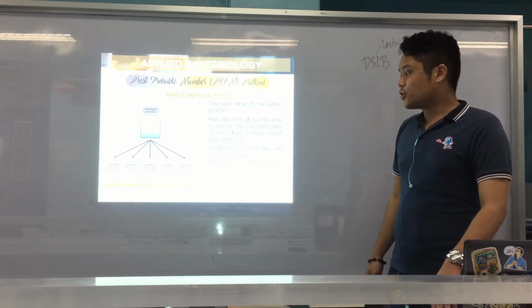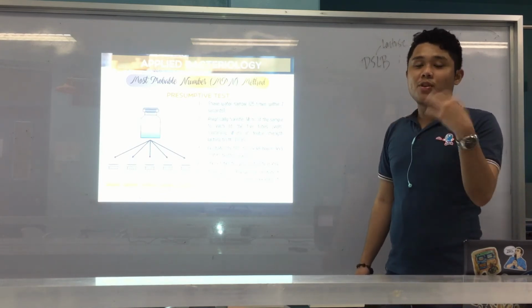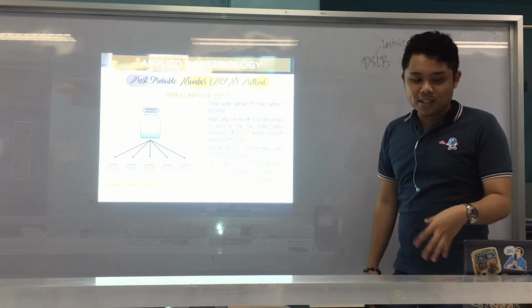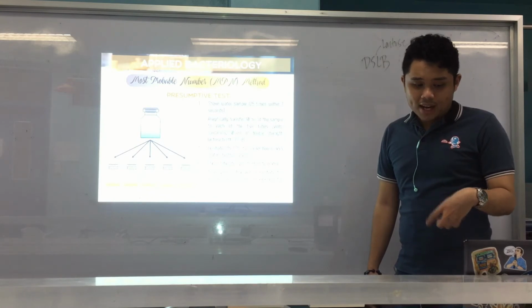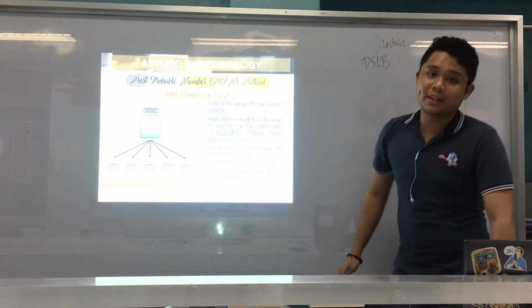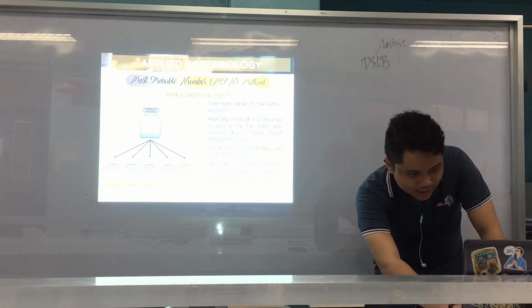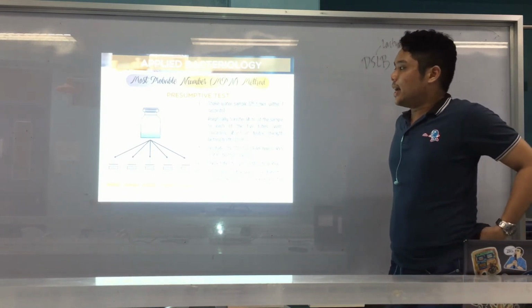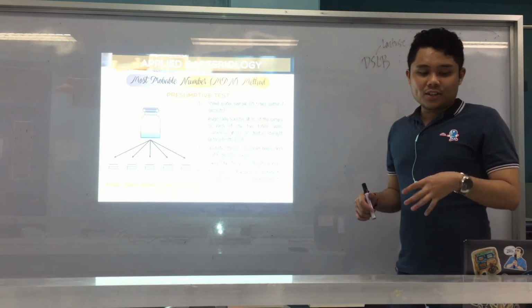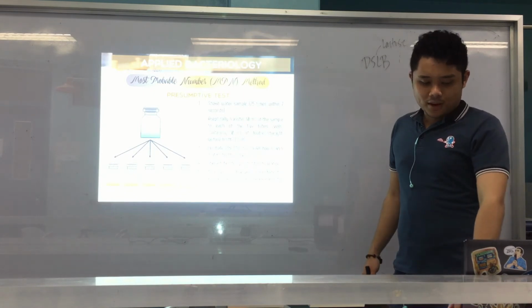Check the tubes for gas formation and of course for turbidity. If there is no gas formation, we re-incubate for another 24 hours. If there is still none after 24 hours, then that is considered negative. The positive one, guys, must have gas. Again, if there is still no gas formation after 48 hours, then that is considered negative. So that's the presumptive test; we are just detecting all lactose fermenters, or all coliforms, regardless of whether they are fecal or from other sources.